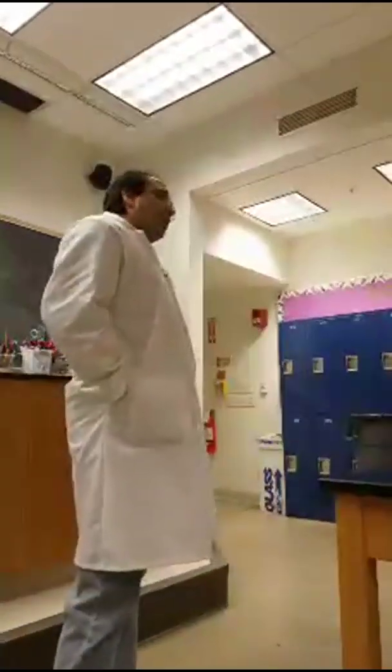In particular, next day we will be doing the gel, and for the gel also we need to prepare a standard curve, and from there we need to find out the molecular weight of a particular band. The same thing, the same way we need to prepare that one, but there is some other method. In the exam you will be provided a picture of a gel and the total distance of that one, and you need to find out the molecular weight of a particular band. Okay, these are the exam questions.